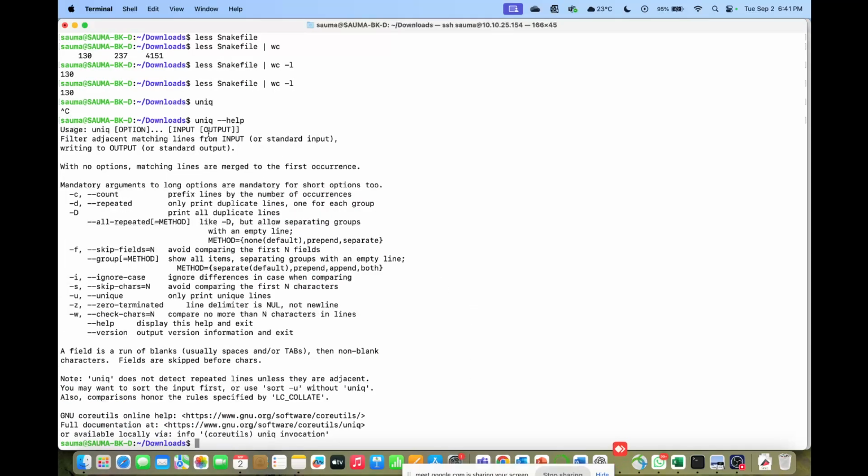Yeah. So if you do one thing to know, if you have any command and after a space you add hyphen hyphen help or hyphen h or anything like that, it'll show you all the possible flags for this particular command.